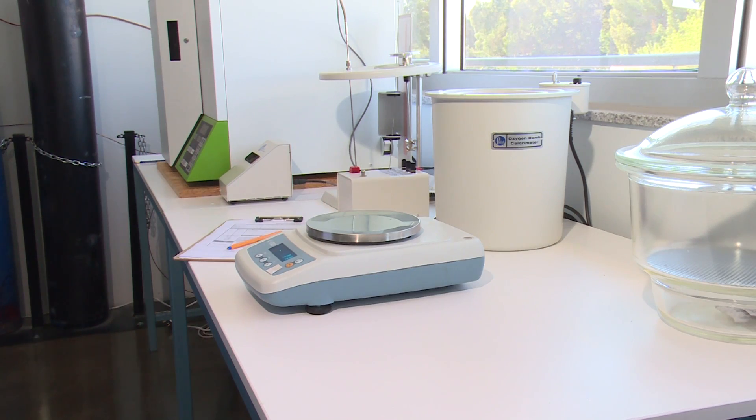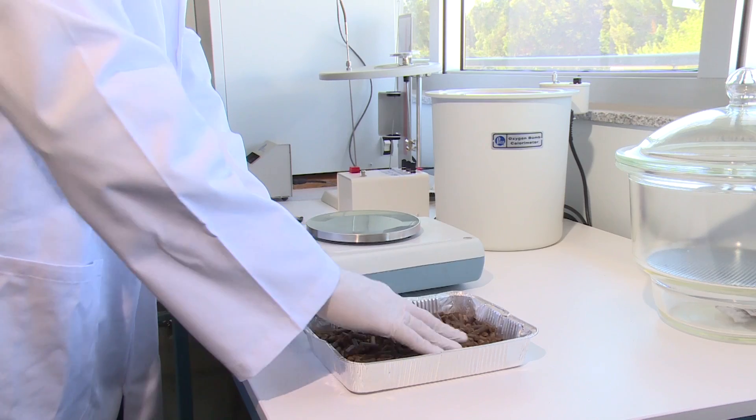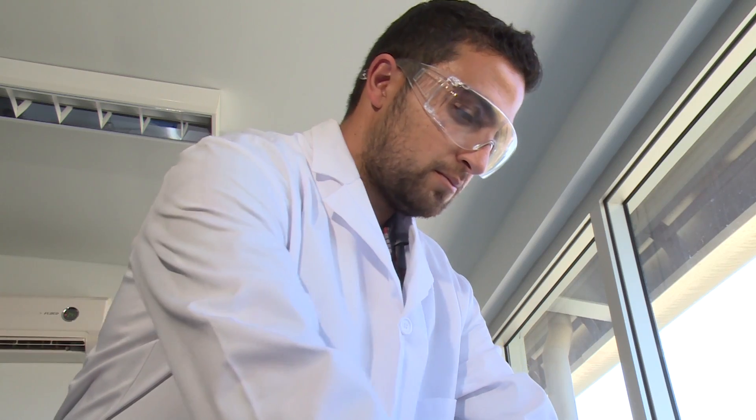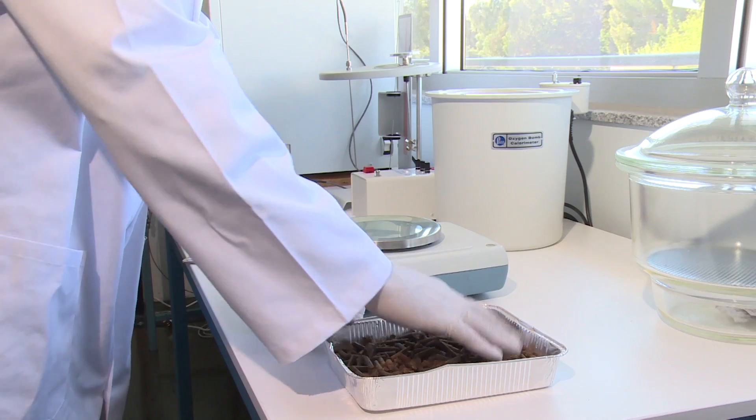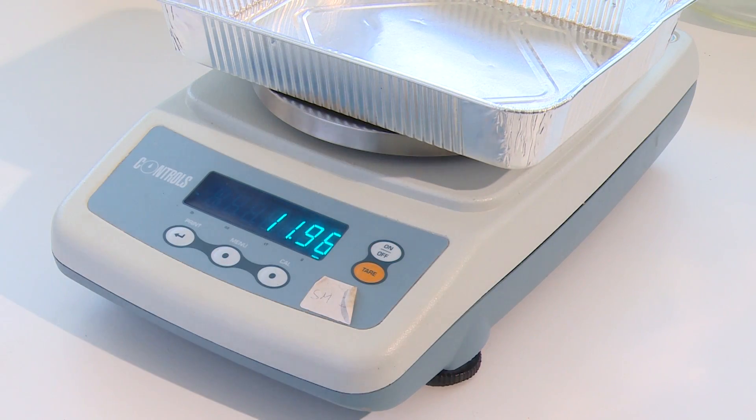Transfer the sample from the container or bag to the tray and spread the sample evenly, allowing about one square centimeter of surface area to one gram of sample. Weigh an identical empty clean tray to the nearest 0.1 gram. Dry the sample packing in the oven and weigh the packing before and after the drying.